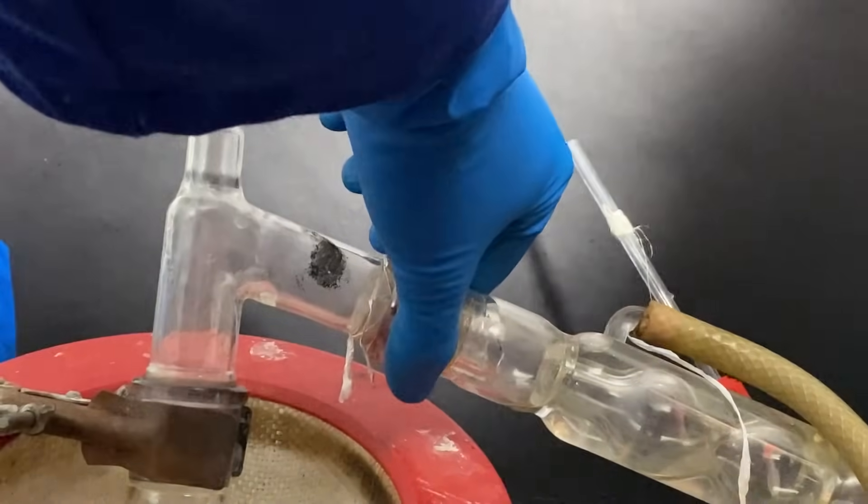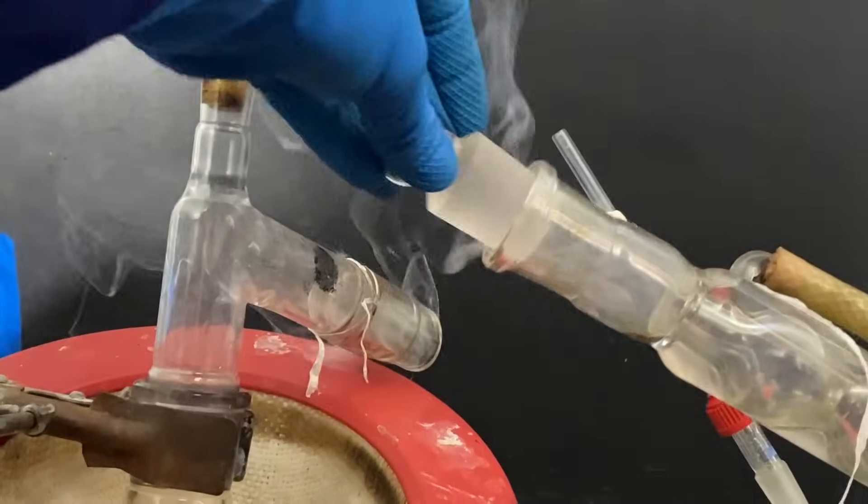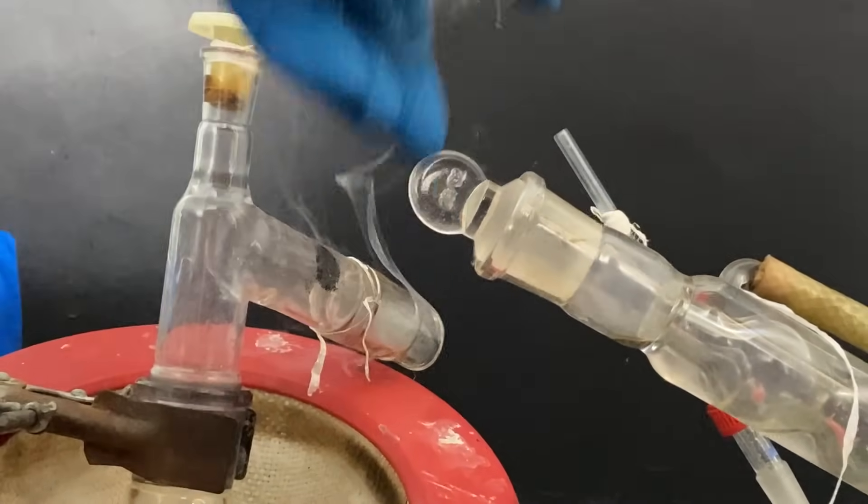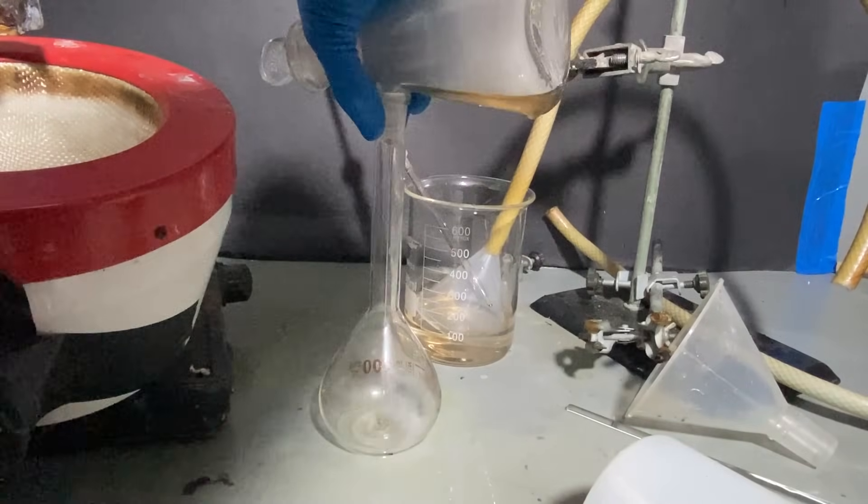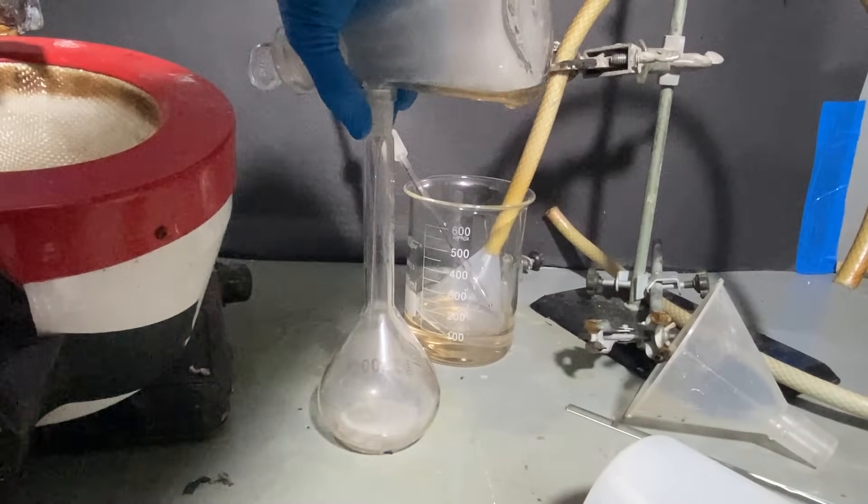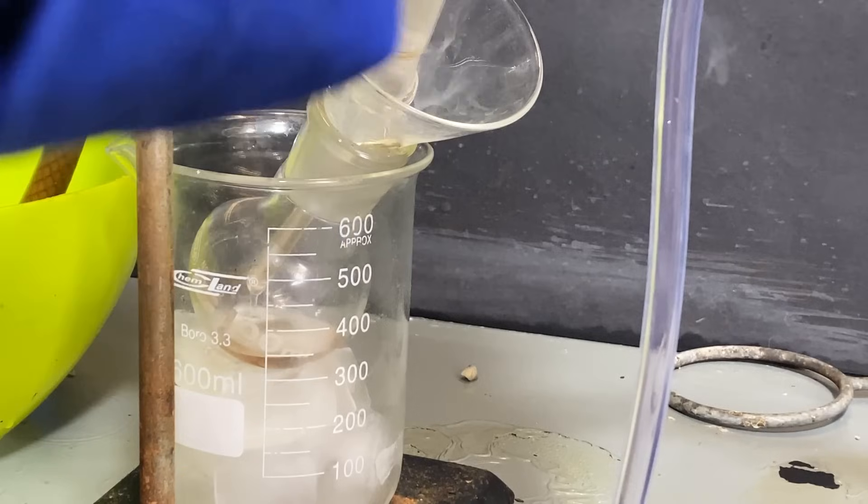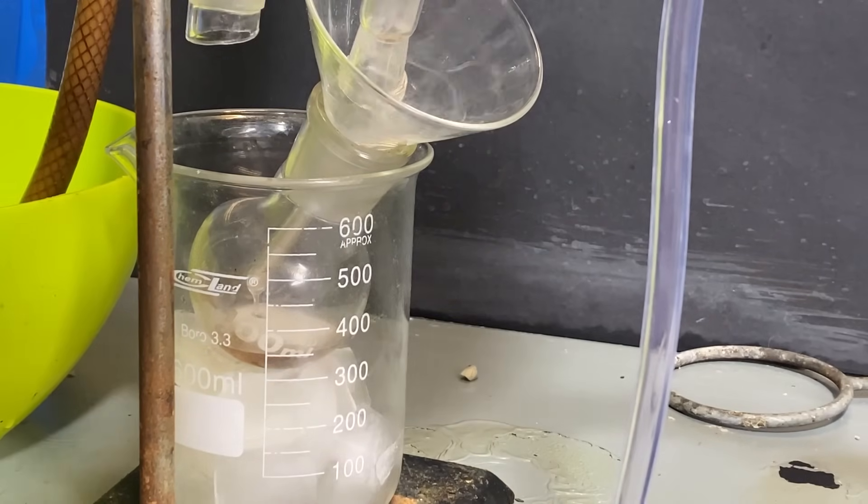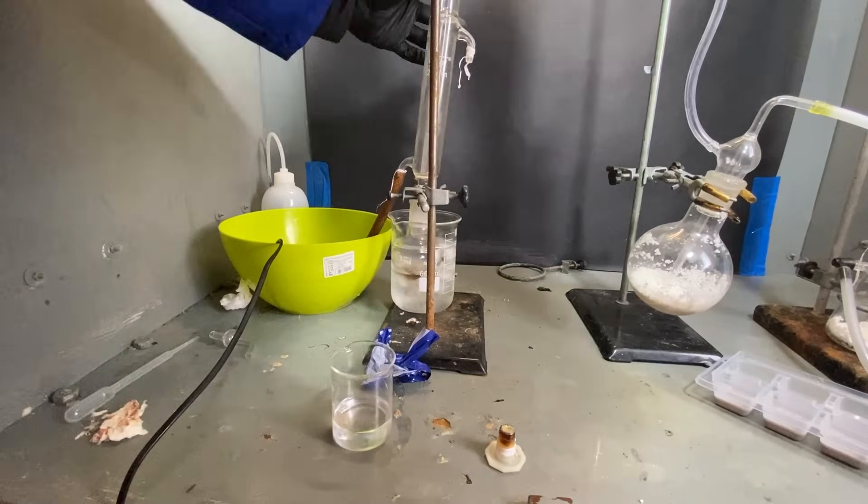Anyway, I've disconnected the condenser, tilted it, so the oleum could flow all the way into the collection flask, and I've collected all the fuming sulfuric acid. Anyway, next day, I've transferred the oleum into a boiling flask, and I've set up this really cringy apparatus.